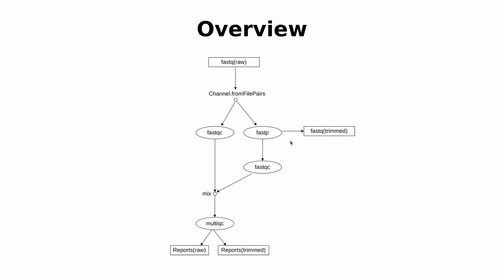So this trimmed reads, actually, I think this line should have been here. It's fine. So the trimmed reads, we will combine all of them, run MultiQC, and then generate reports for raw and then trimmed reads. So this is what we have. So it's getting interesting. So just stay put and then let's proceed. So we will move to the next activity.